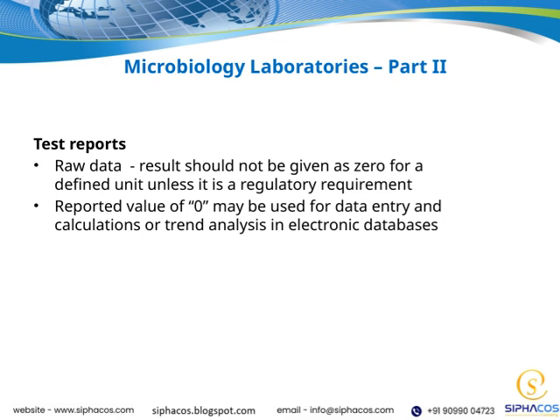Also, when entering data into electronic databases, a reported value of 0 can be used for data entry, calculations, or trend analysis. This helps maintain consistency and ensures that trends are correctly observed over time. As we focus on microbiology laboratories in this part, it's crucial to understand that accurate reporting of results supports reliable microbiological assessments. Overall, clear and precise data entry and test reports underpin the integrity of our microbiology testing processes and ensure compliance with standards.